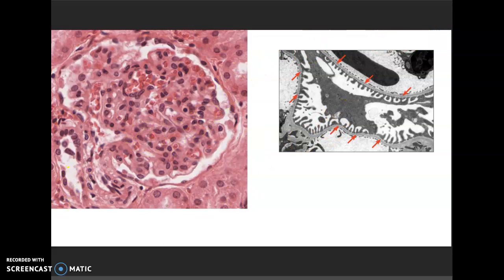So we are going to label this one glomerulus. So A, glomerulus. First off, you are going to label the glomerular capillaries. They're in there. Those are the glomerular capillaries. Then this is a glomerular capillary, and maybe make it like this so they could see it's this whole thing. Same thing for this. This is all the glomerular capillary.